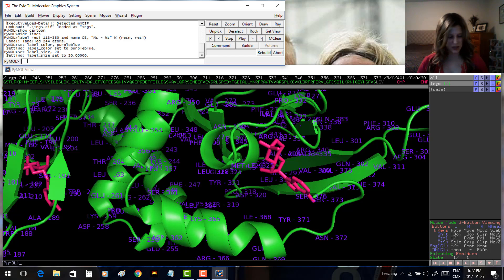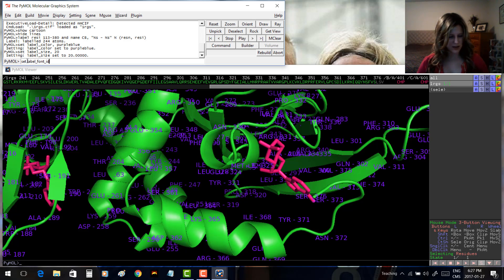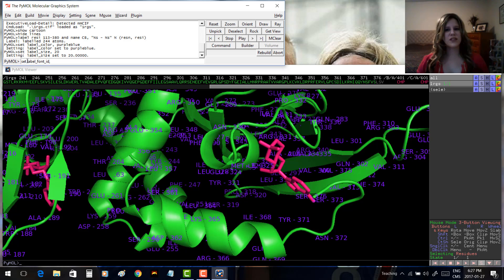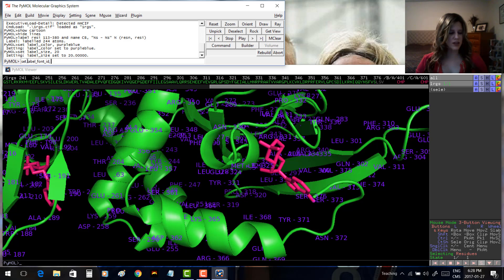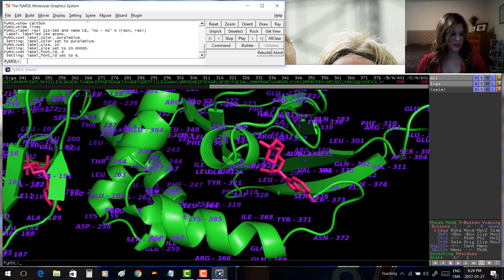Maybe you don't like the font and want to change it. Type 'set label_font_id,' followed by a number for the font. You can look online to see which number corresponds to which font — you can choose between numbers 5 to 14 for different fonts, and fonts 15 and 16 are Unicode fonts. For example, let's choose font 8, which looks a little different from what we had before.